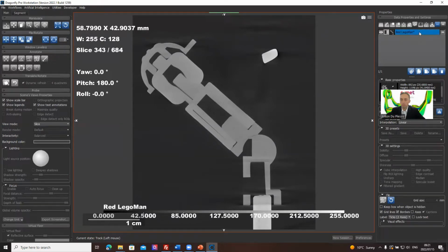This is where the data set is, this is the object, or this is called an image channel. So we can put the image channel, we can visualize it on and off. If you have multiple things, you can usually visualize the one that is on the top of a list. So the most recent one would move to the top of the list. And you can also visualize in 3D, put the 3D visualization on and off there.